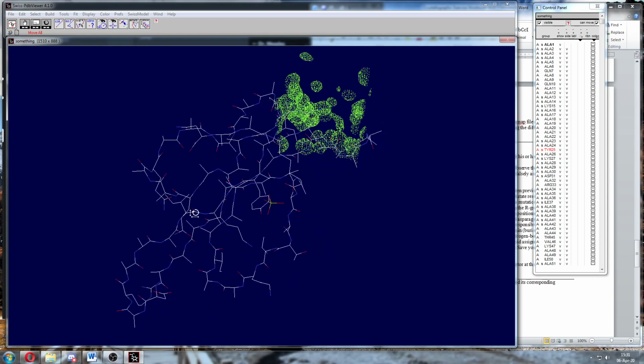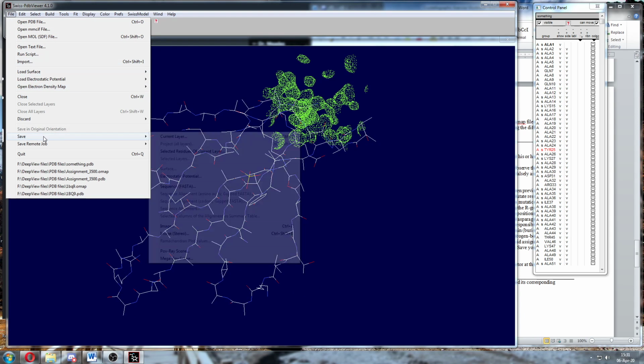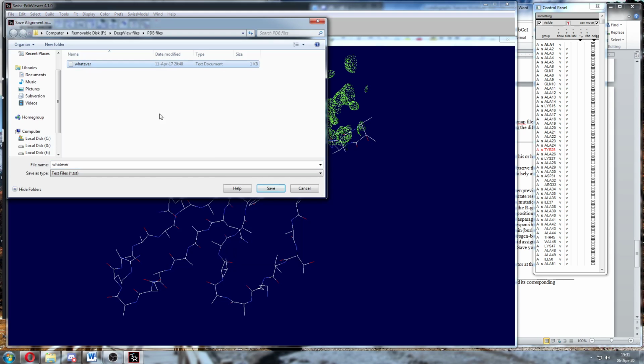All right, so looking at that. You can also save one more thing. When you're finally done, we're going to save the sequence. So we already saved the current layer. We want to save the sequence. We're going to call it whatever. I prefer you call it your last name.